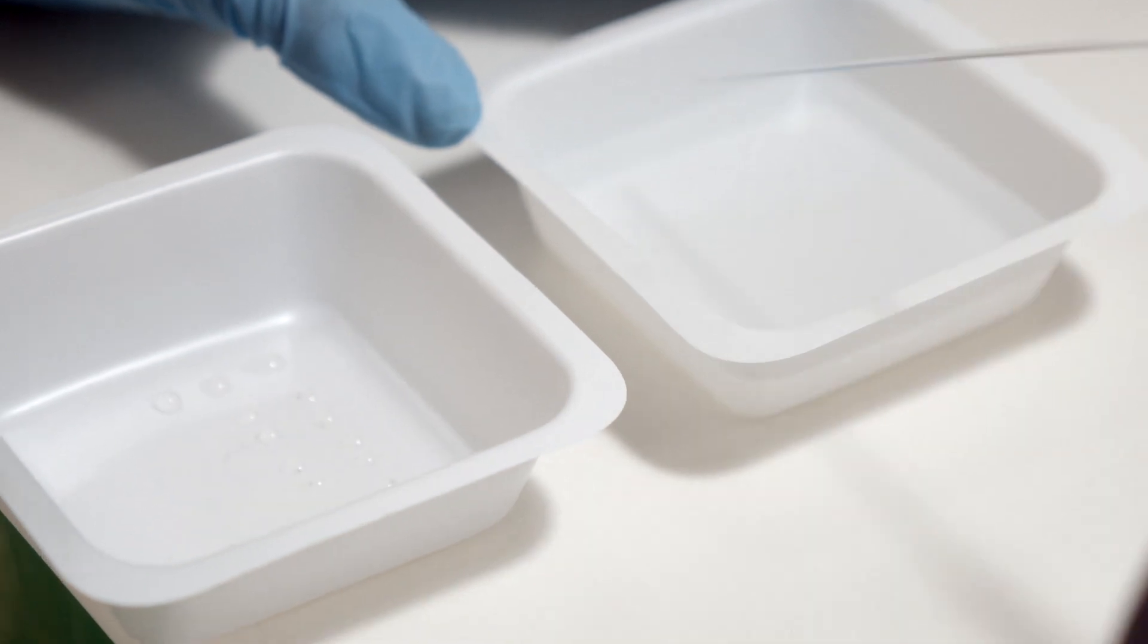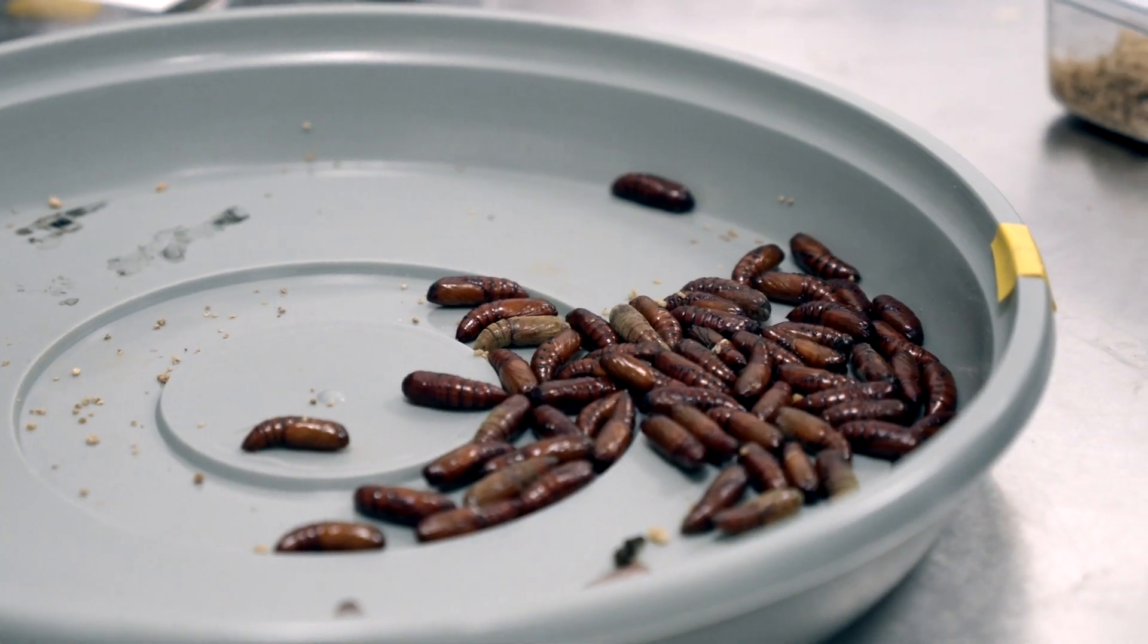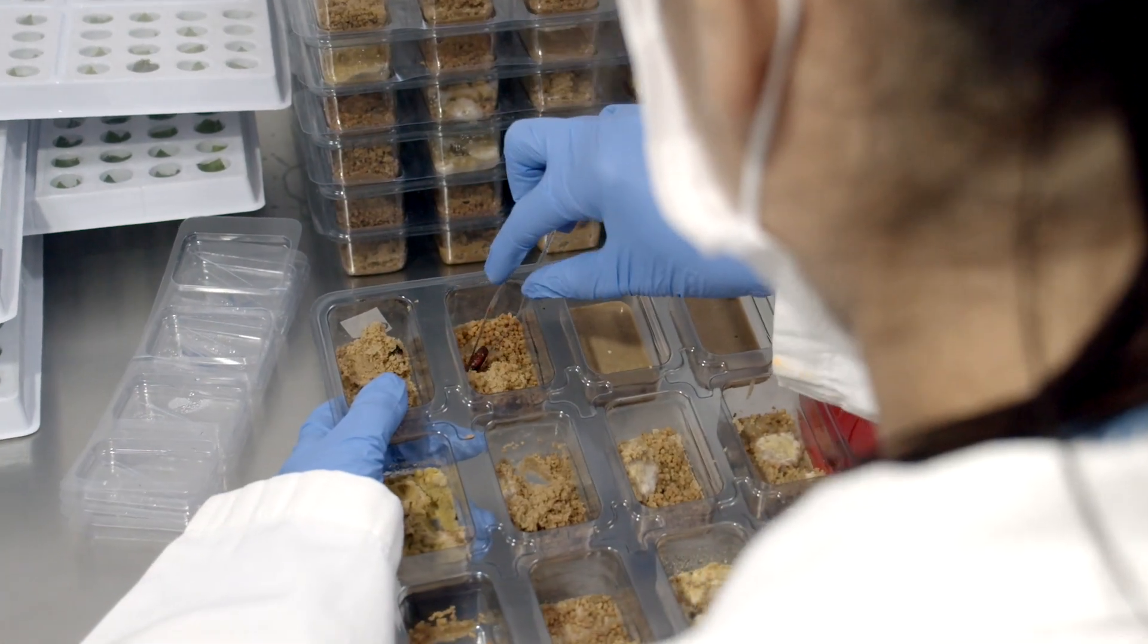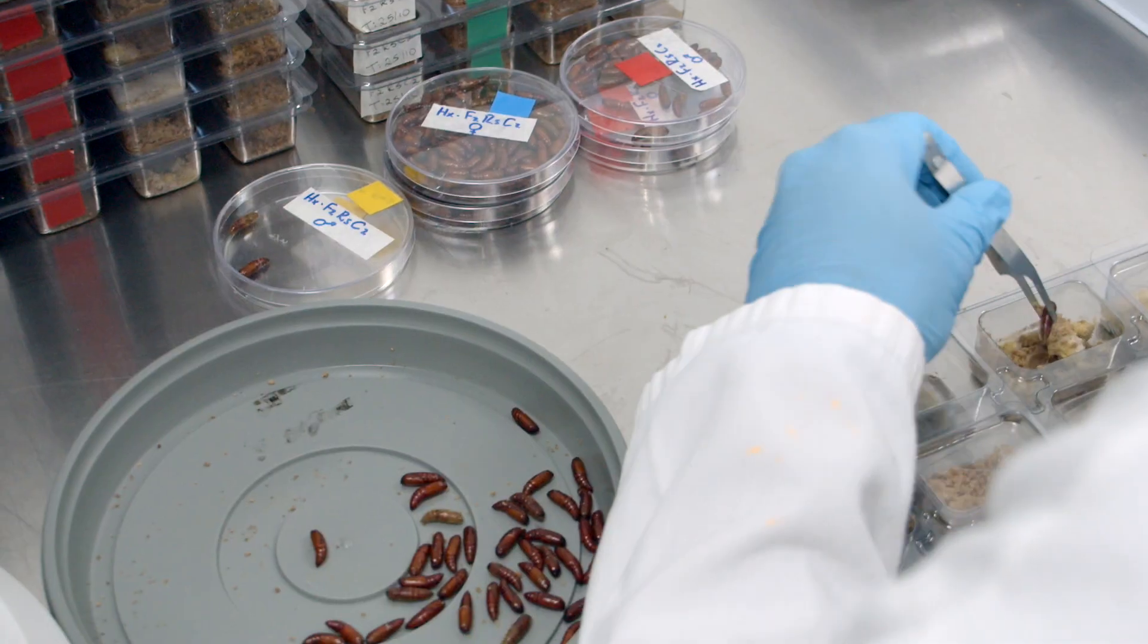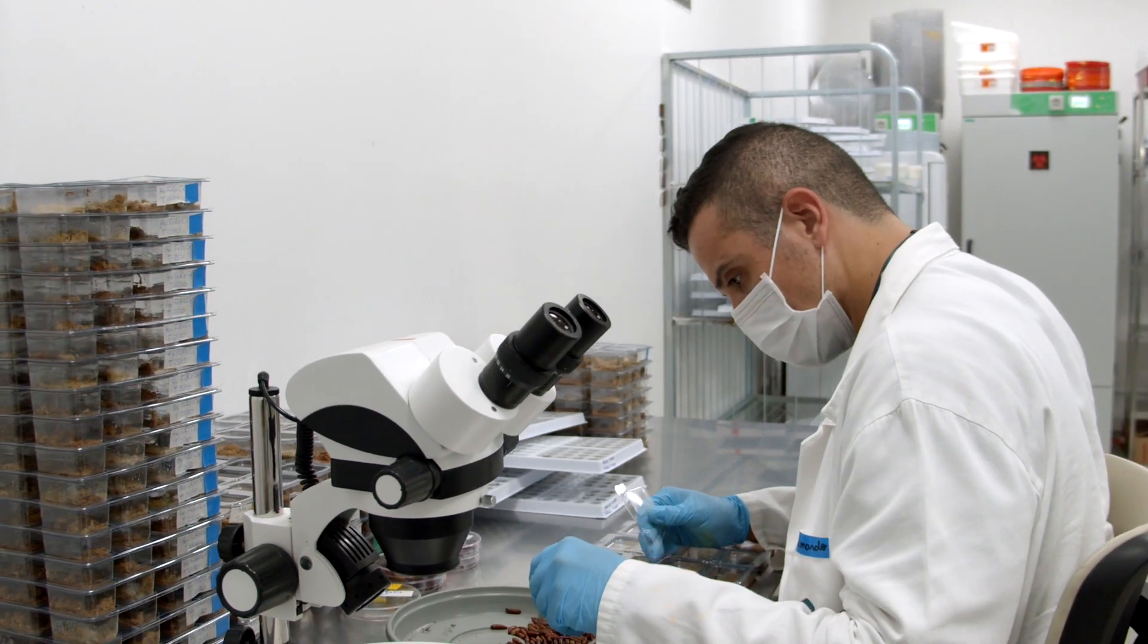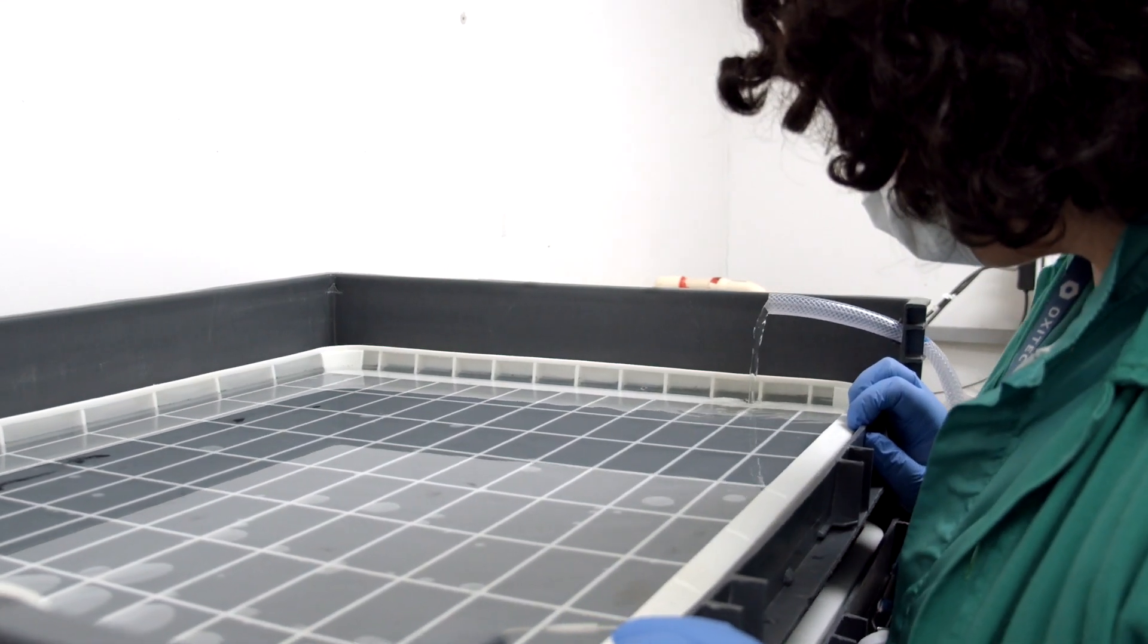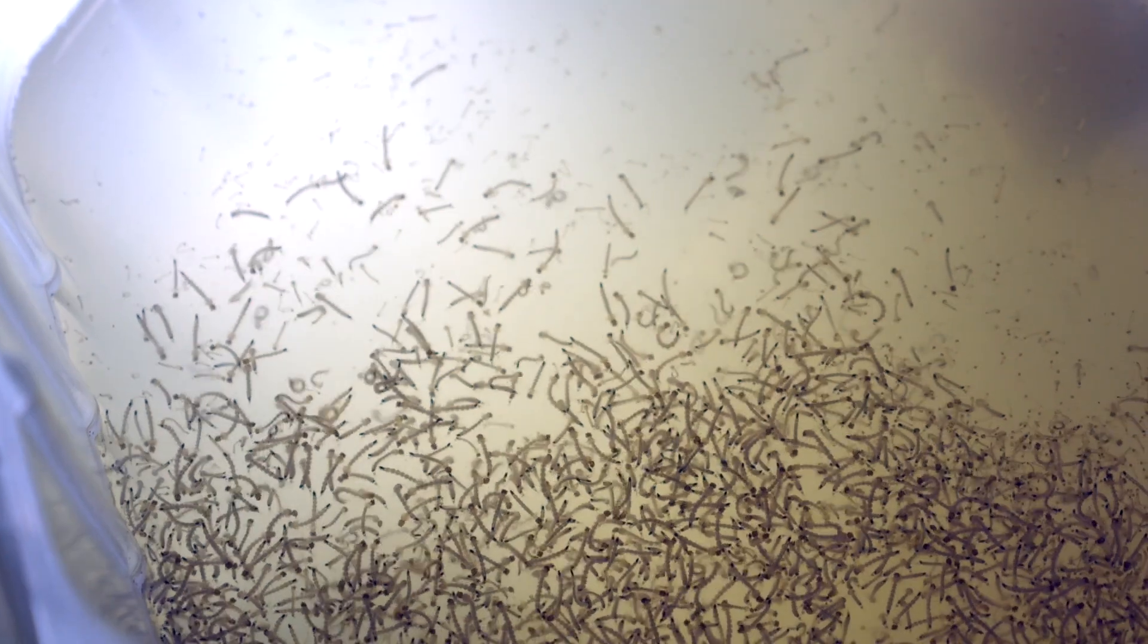In Brazil, we have the same insect-rearing processes and product development programs found in the UK for Aedes aegypti mosquitoes and our agricultural pest solutions. The projects start in the UK for strain generation and proof-of-concept, and once the new strain and its processes are ready to go to the field, the technology transfer process starts. Once in Brazil, there is an optimization for the local conditions and validation involving producing eggs at scale.